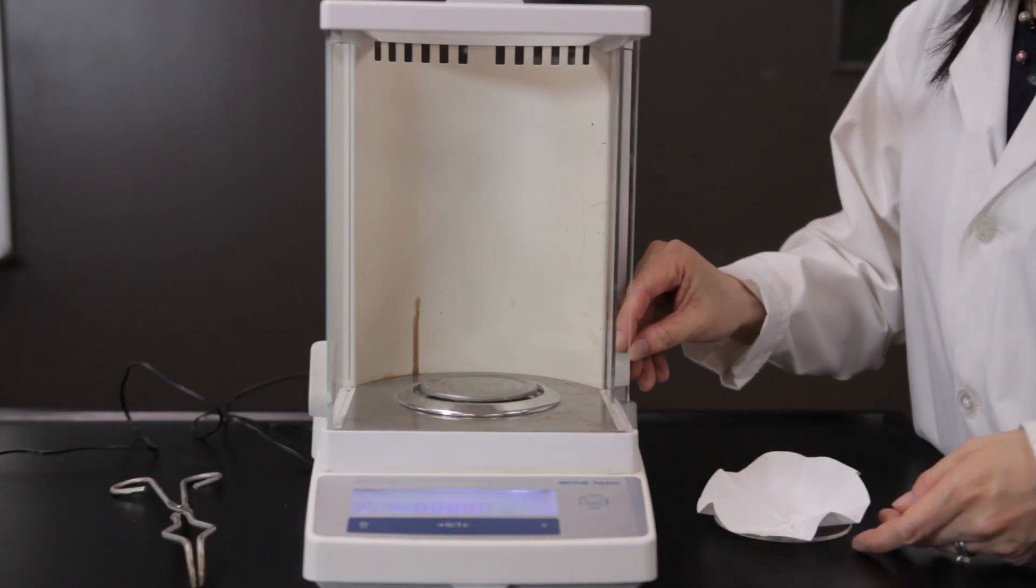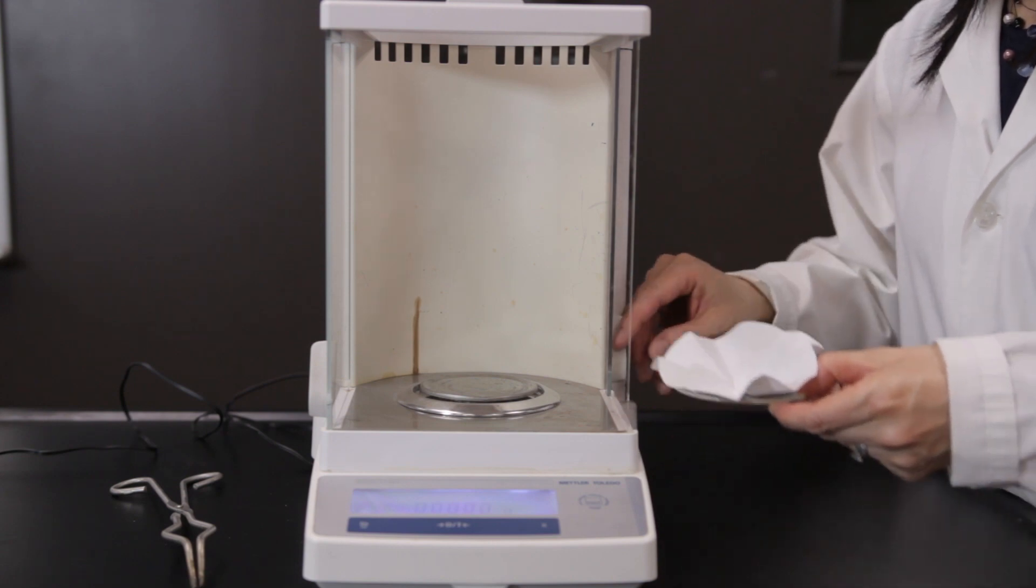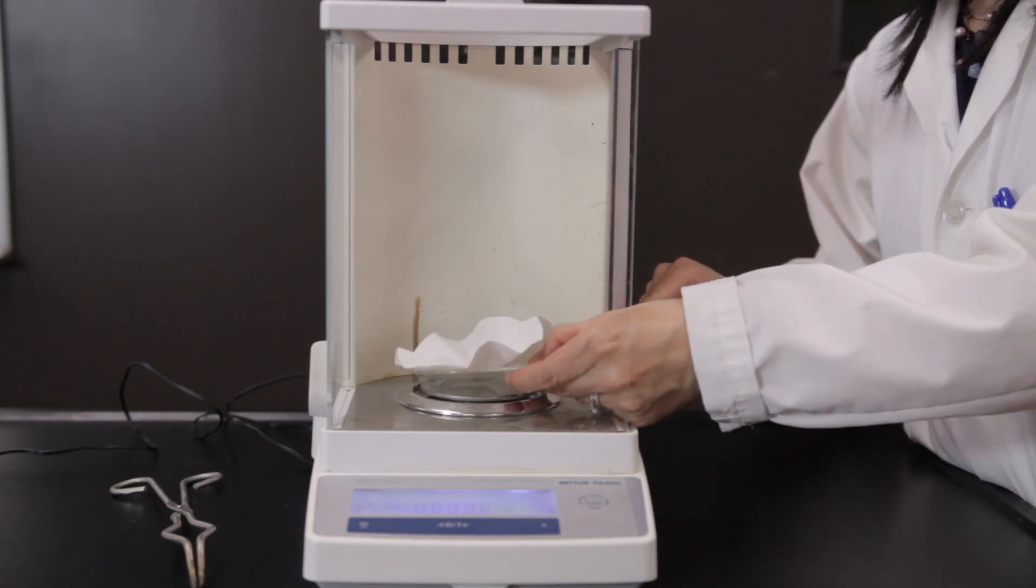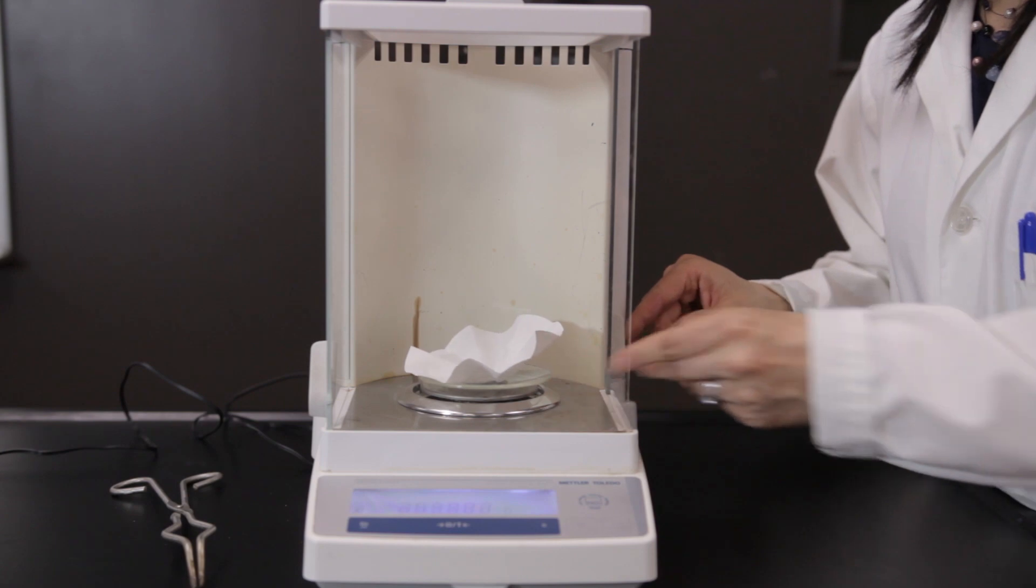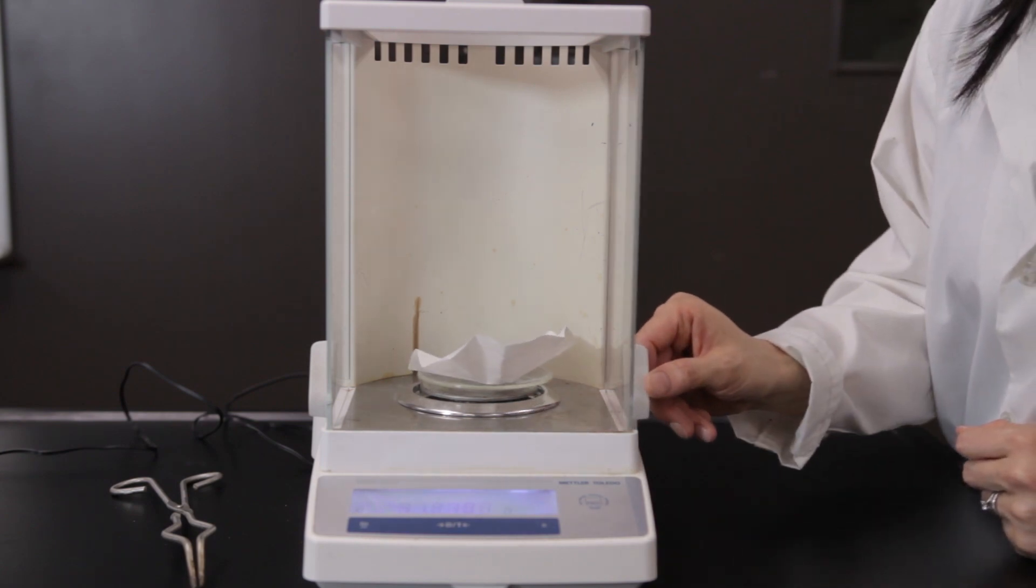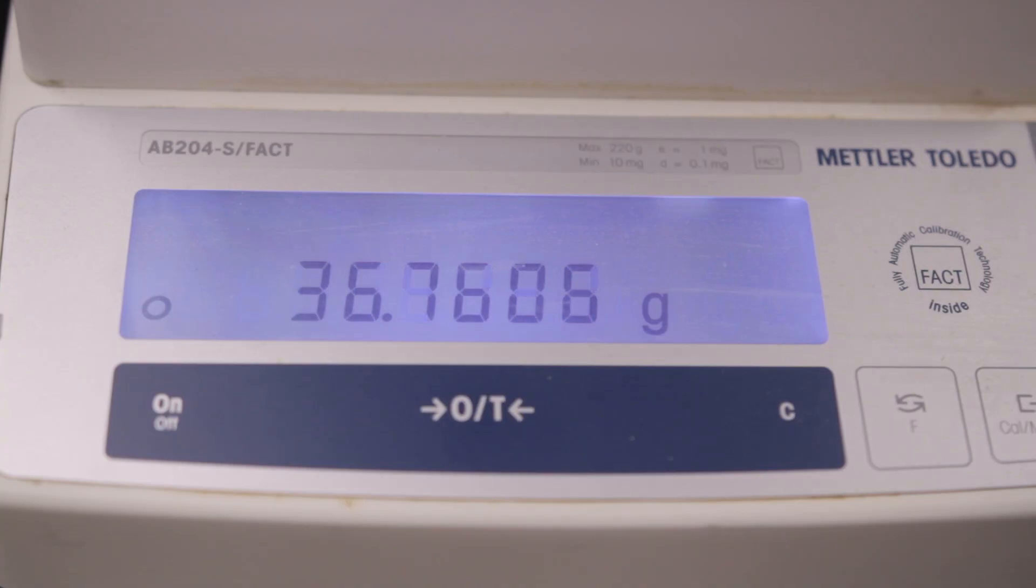Weigh the precipitate, filter paper, and watch glass together. Record the exact mass.